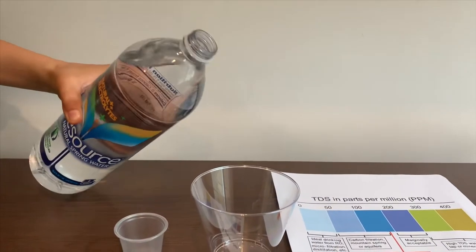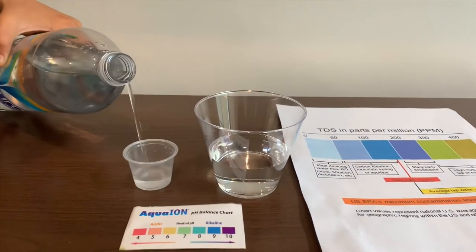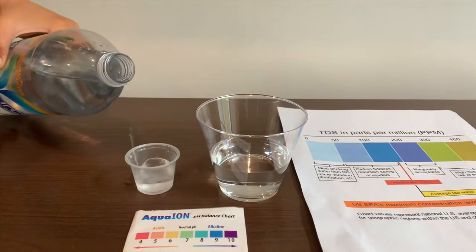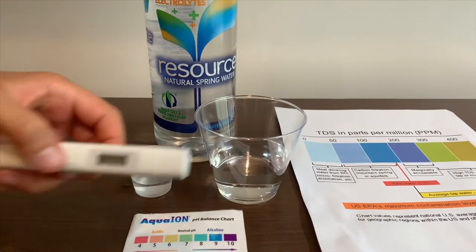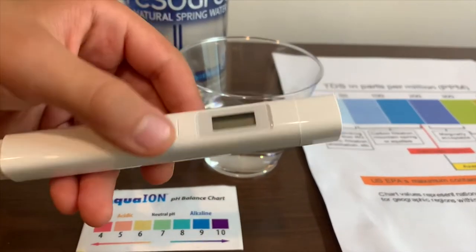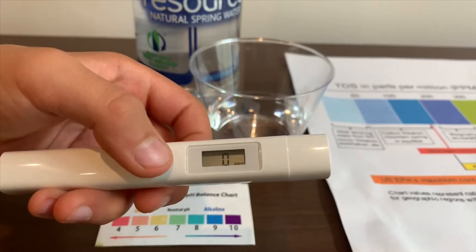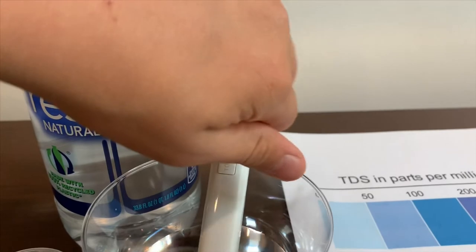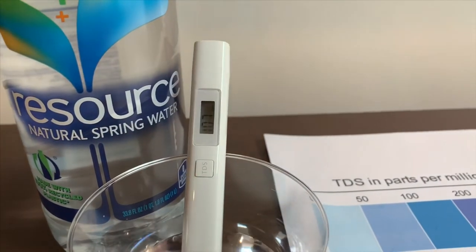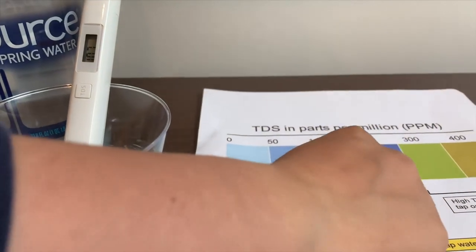Let's pour some water in. We're going to test the TDS level. If you want to buy this TDS tester, check the link down below. Turn on the TDS tester, make sure it says 0, and put it in. 107 — that is okay to drink.